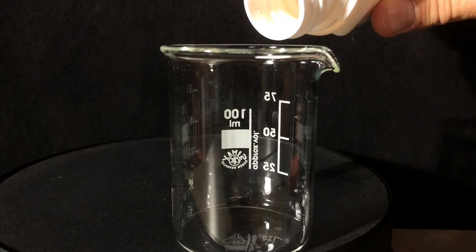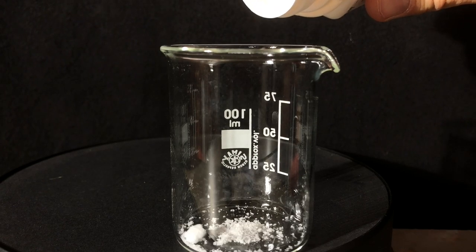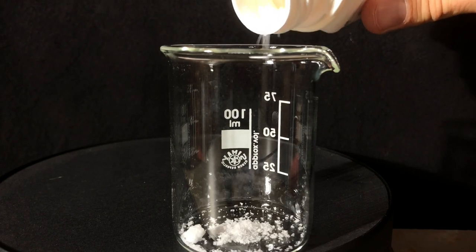To start off with the experiments, 1-2 grams of silver nitrate were added to a beaker. The exact amount doesn't matter as it will look beautiful either way.